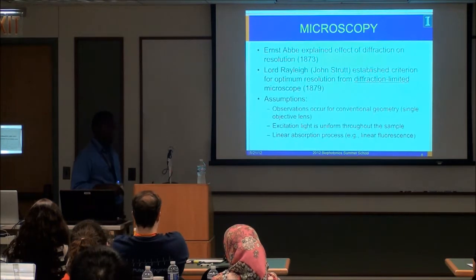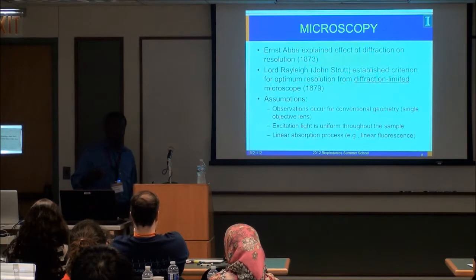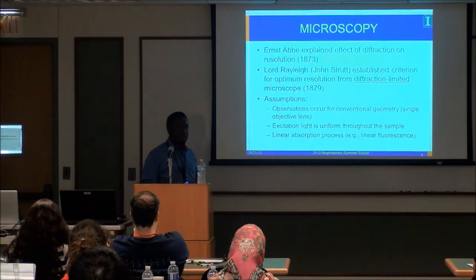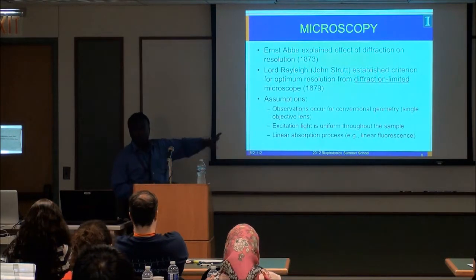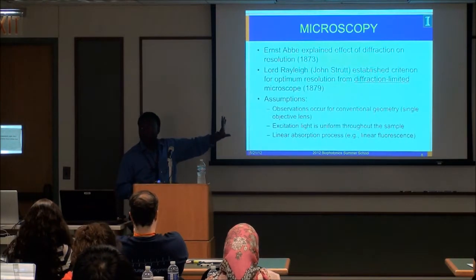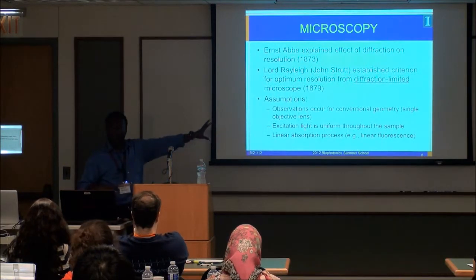And we're dealing with linear absorption processes. We know there's such a thing as STED, for instance, stimulated emission depletion microscopy, that does not follow this. So when we're talking about the Rayleigh criterion, these are the implicit assumptions. That just means that rules are meant to be bent once you figure out what the assumptions are.